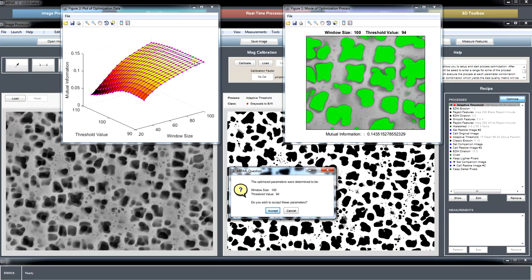So we can't be certain that that's truly optimal. And I could expand this range more and more. What you would see though is that the optimum set is always going to be at the range. And this sometimes is an issue when you have this severe variation in intensity.